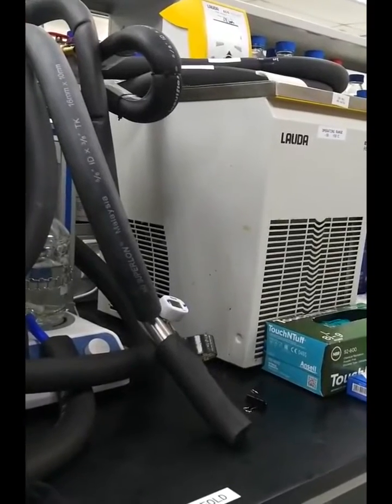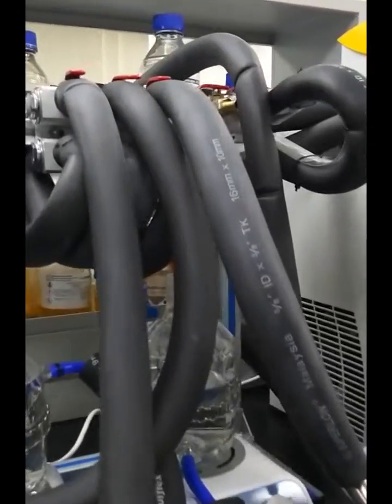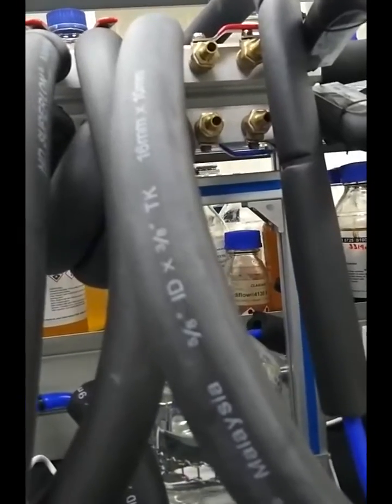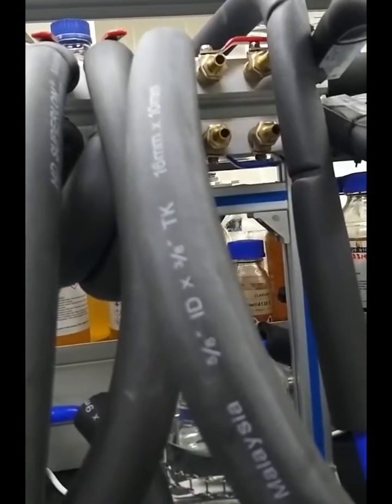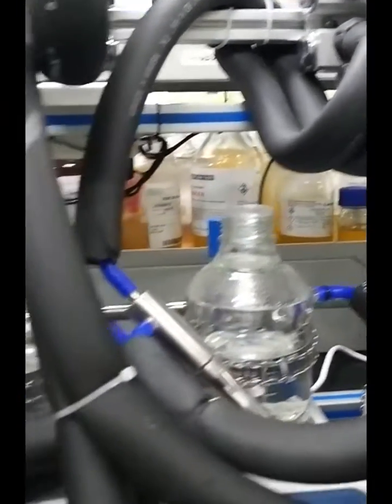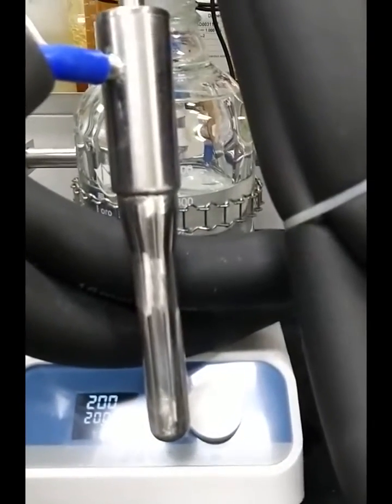The low temperature is provided by the chiller, recycled through the water distributor, which identically provides low temperature water to individually three cold fingers. The cold finger was made with stainless steel.